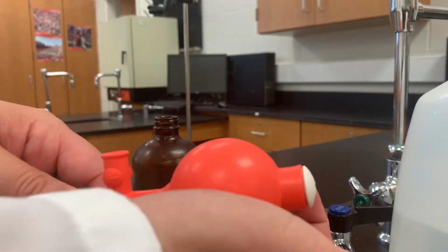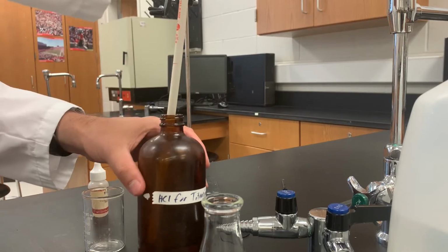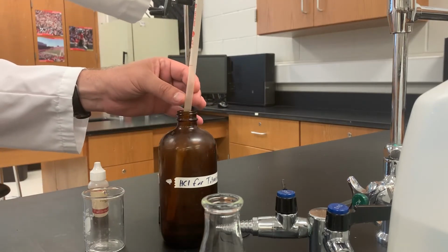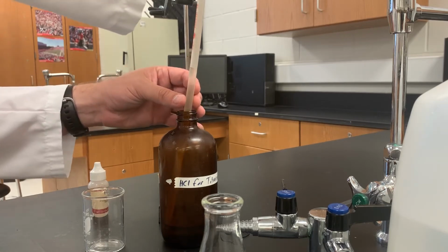I've got this thing called a pipette bulb, which I'll squeeze to initiate it. Then I'll put the pipette into the solution, and then I push the up arrow, which will draw the hydrochloric acid up into the pipette until I reach the line.